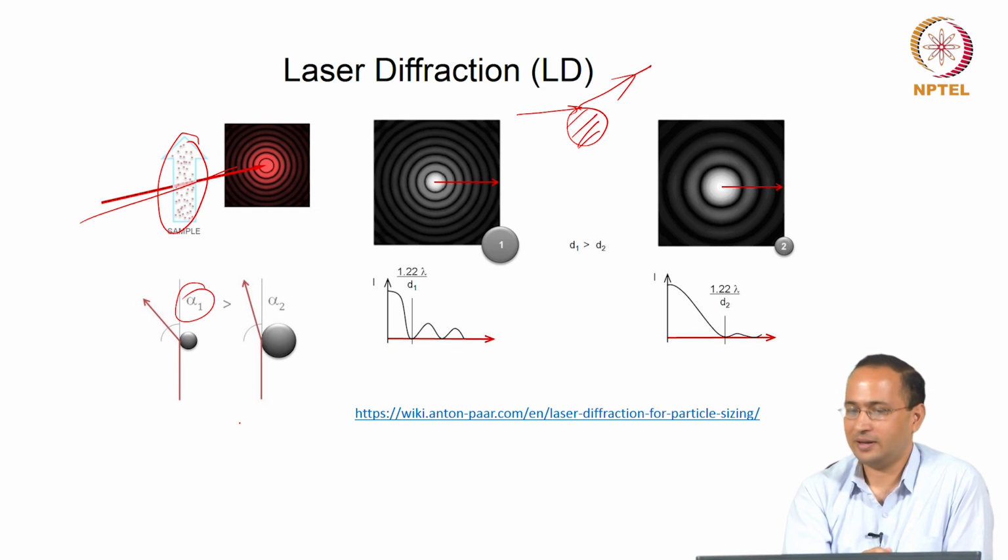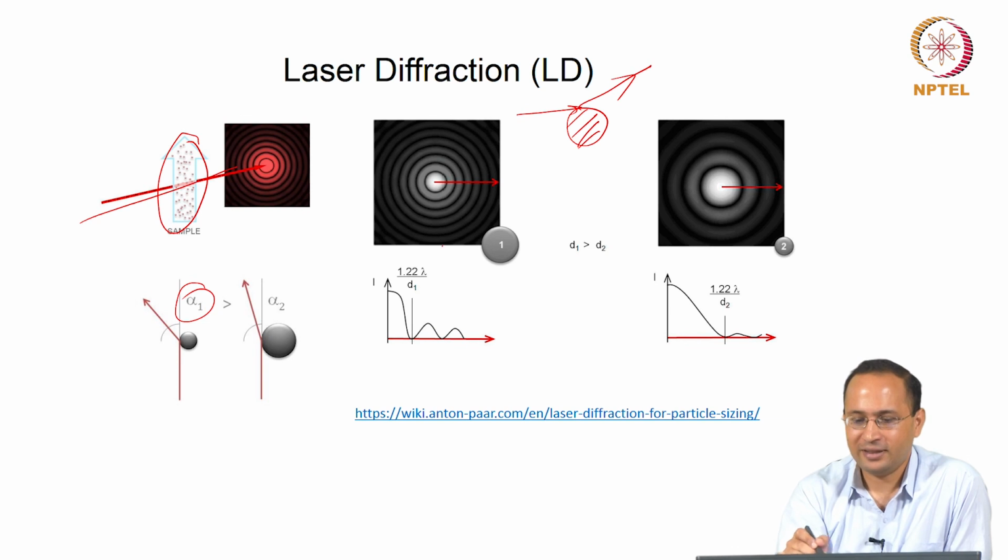that can be used to get an idea about the size, right. Also intensity, now you see these rings, right, what you see, in the case of D1, where your size D1 is greater than D2. So, you have a difference in the intensity also, right, compared to here.